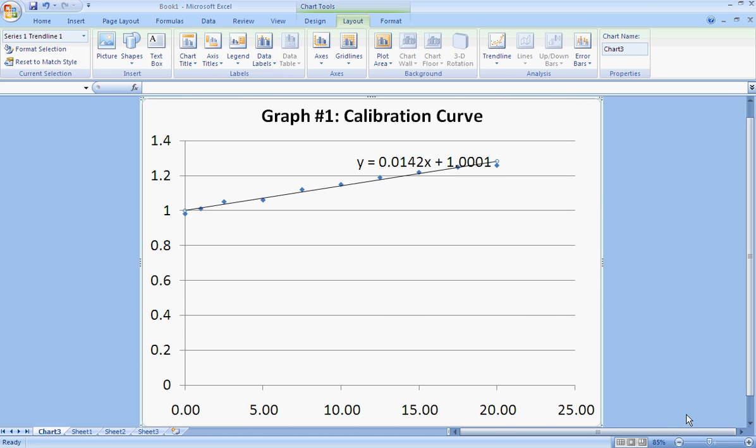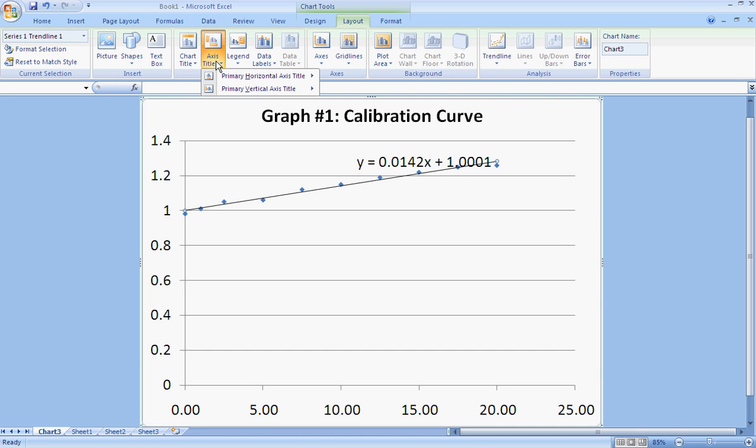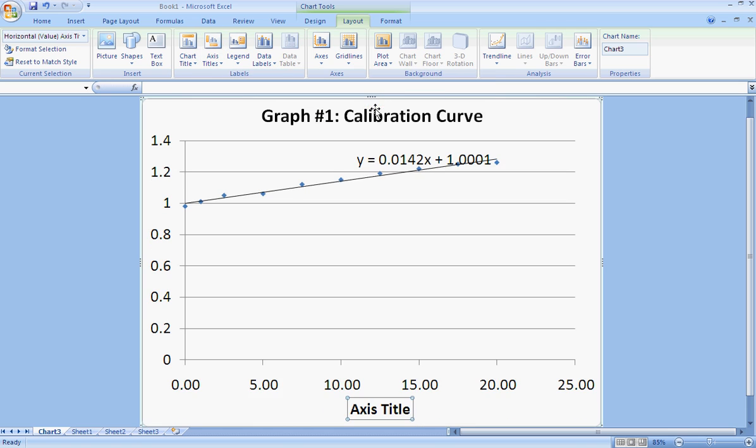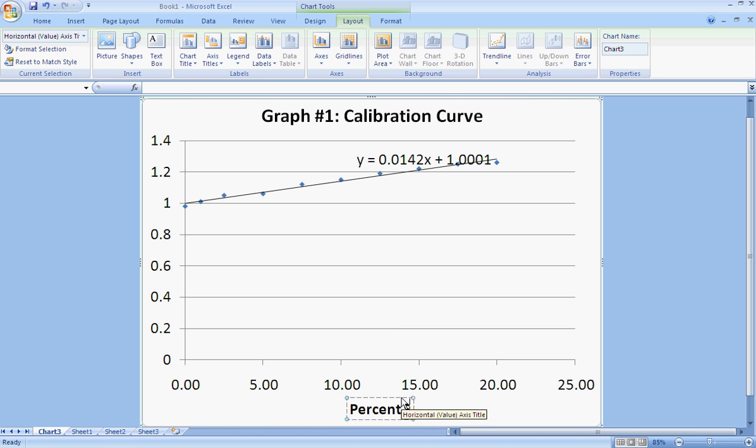All right, the only thing remaining is one of the fatal flaws in making graphs. You can never have your axes unlabeled. So I need to come up here to my axes title. The horizontal axis, I'll display that below. So my horizontal axis is the percent sugar.